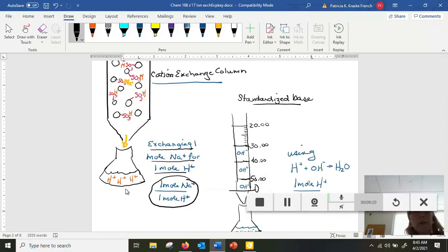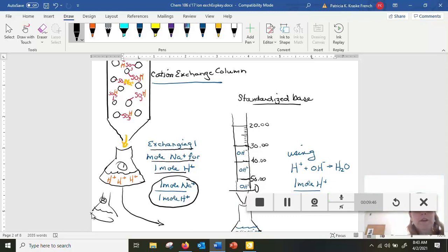So now what do we do? Well, we move this flask away. We mark it number 1, and we put number 2 flask underneath it and do the exact same thing again. And then wash it really well to make sure we have all of our hydrogens down in that Erlenmeyer flask. So we have number 2 with its hydrogens.